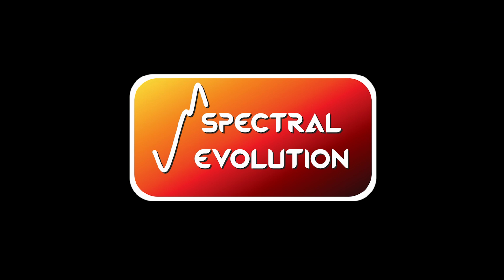Going back to the water content question we had before, what you could do is look at the senescence of a leaf over time, and the amount of water drying over time. You could take spectral measurements on that leaf over time, and if you know what the water content is, you can use that as a reference for future measurements.